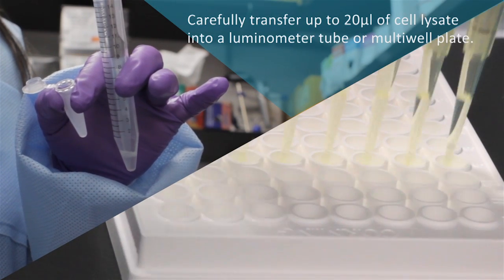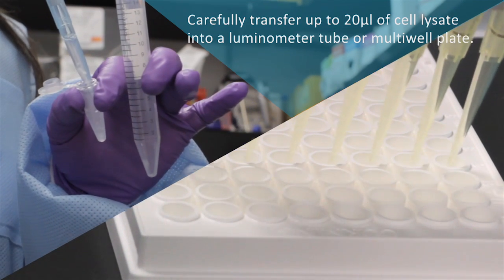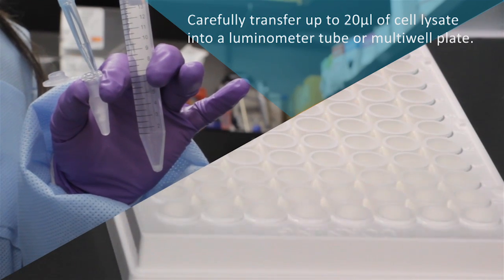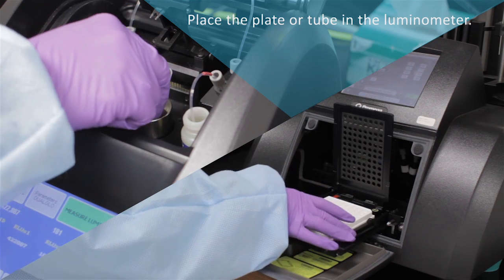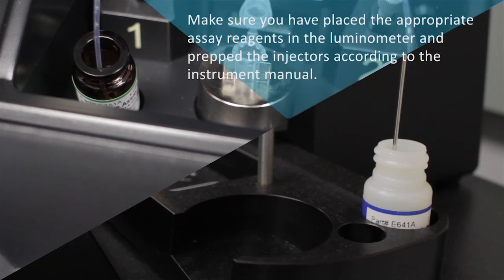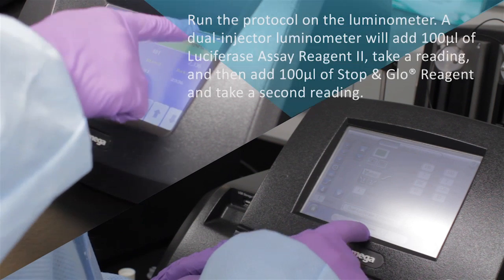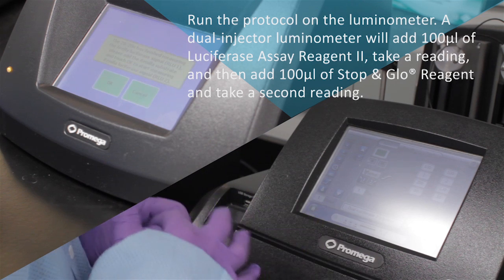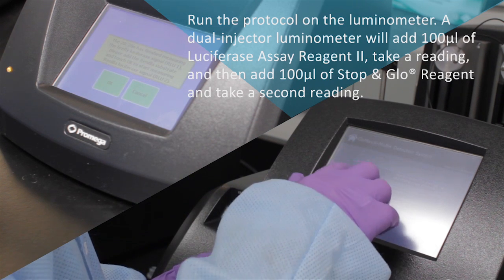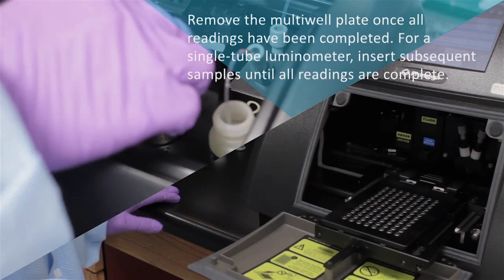Carefully transfer up to 20 microliters of cell lysate into a luminometer tube or multi-well plate. Place the plate or tube in the luminometer. Make sure you place the appropriate assay reagents in the luminometer and prep the injectors according to the instrument manual instructions. Run the protocol on the luminometer. A dual injector luminometer will add 100 microliters of Luciferase Assay Reagent II, take a reading, and then add 100 microliters of Stop & Glo Reagent and take a second reading. Remove the multi-well plate once all readings have been completed.